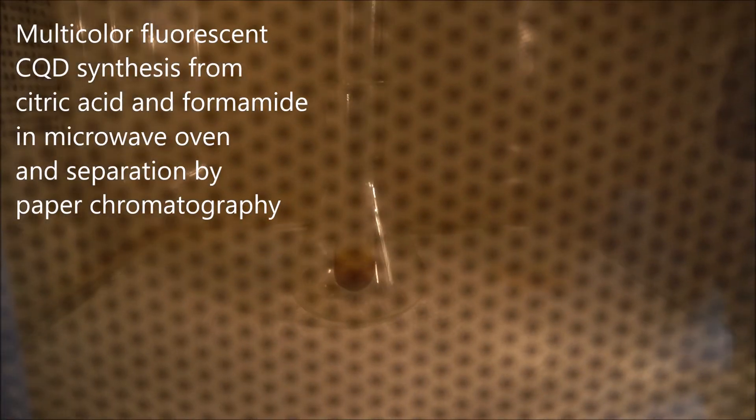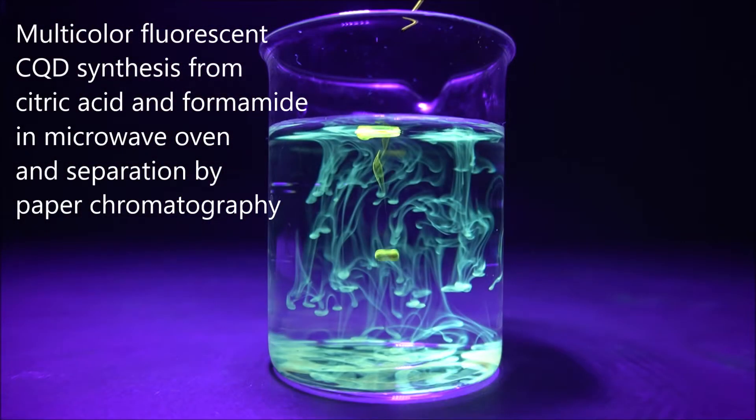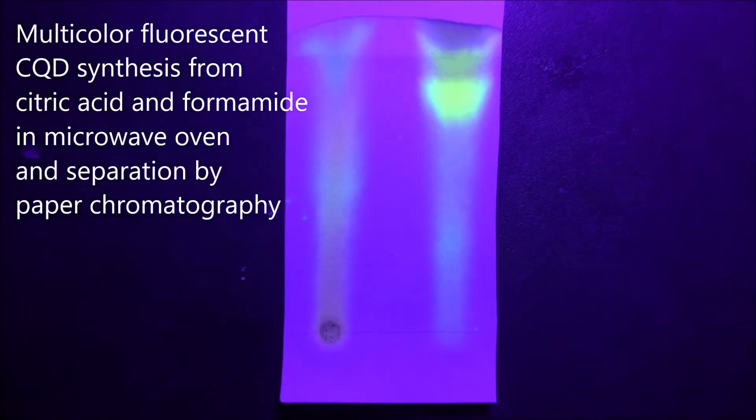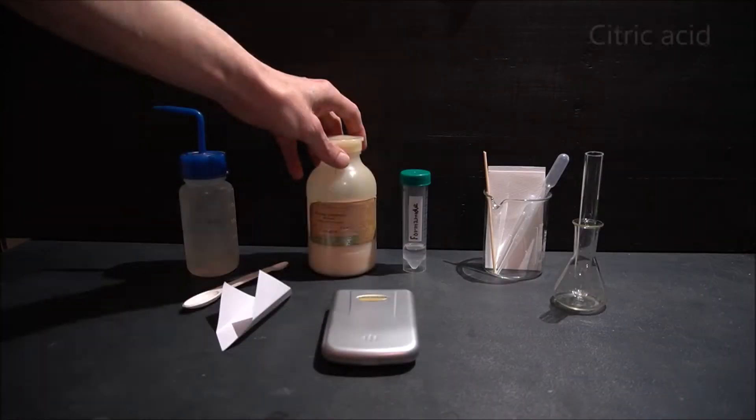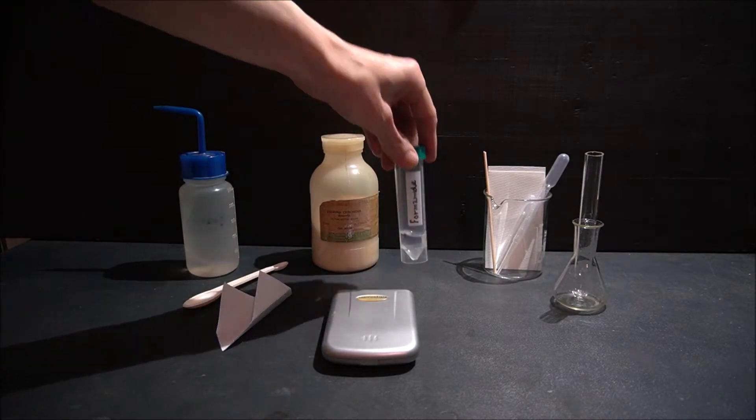Hi, let me show you how to make multicolored fluorescent carbon quantum dots and separate them by paper chromatography. We'll use citric acid and formamide for the synthesis.